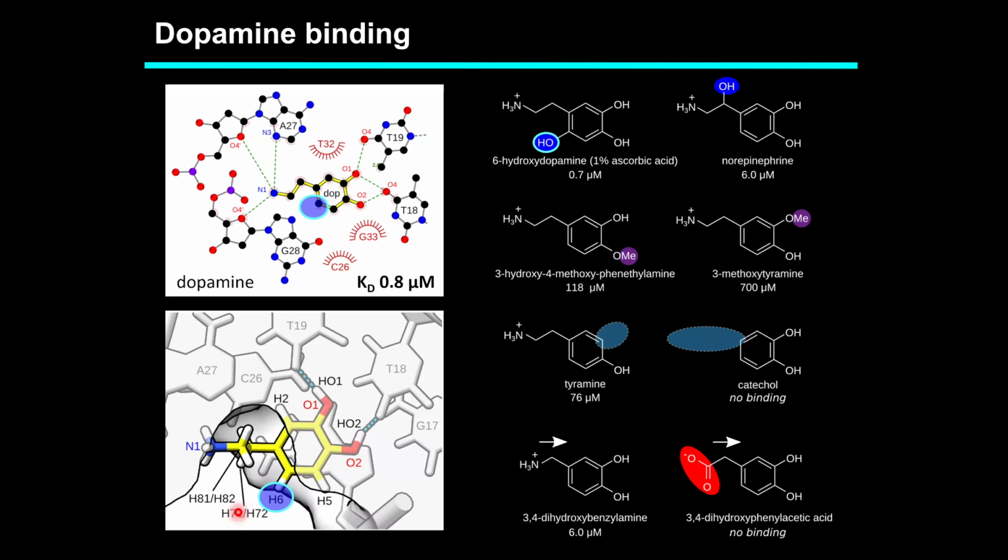So it has actually no effect. The normal dopamine is 0.8 micromolar. This one is 0.7, so no effect. Makes sense. We can add it to the aliphatic part of the molecule. Again, it's solvent exposed down there, and again, it's fairly consistent. Perhaps it's a little bit closer to the surface or changes some dynamics of that part of the dopamine.